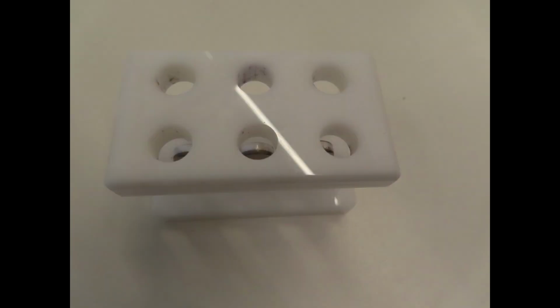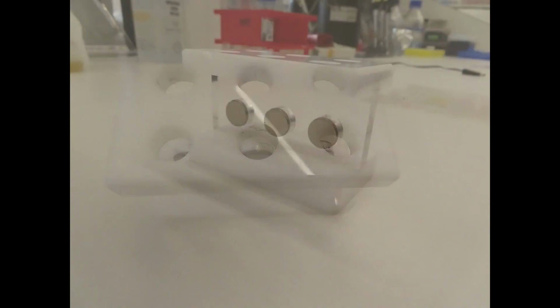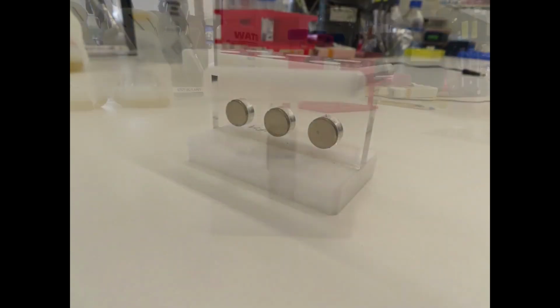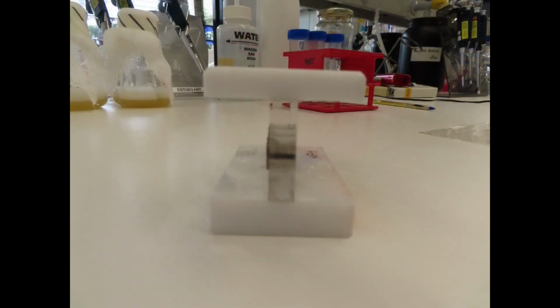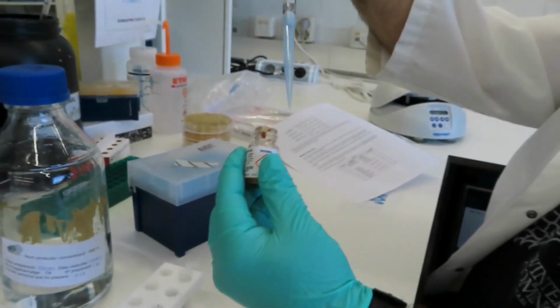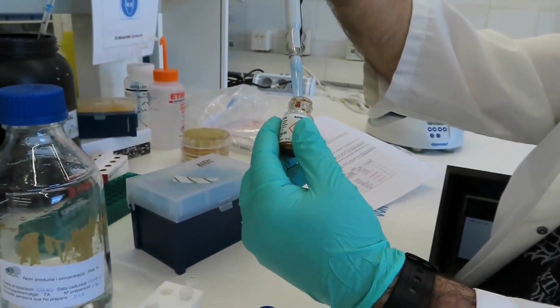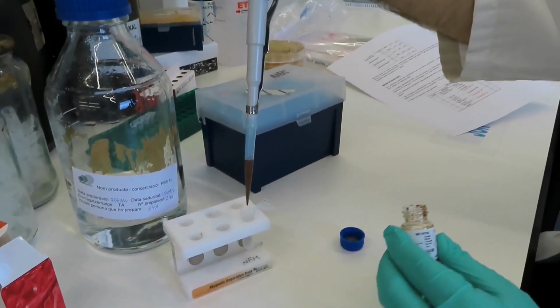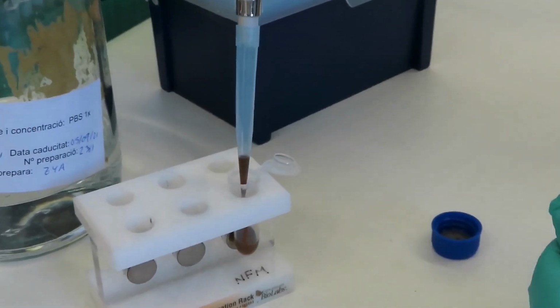The magnet used in this case is this 6-Eppendorf rack with round magnets located on both sides, but other magnet models for larger volumes and larger numbers of samples are available. Dynabeads with this brownish coloration are stored in a preservative buffer that must be removed. So the first step is to take the desired volume of beads, place them inside a tube and introduce it into the rack.